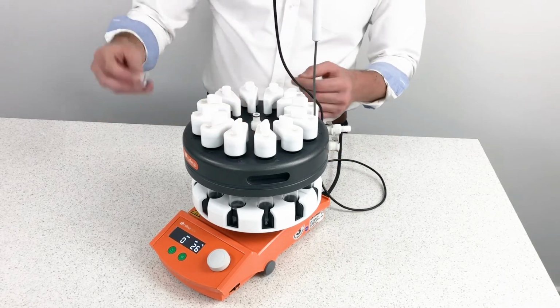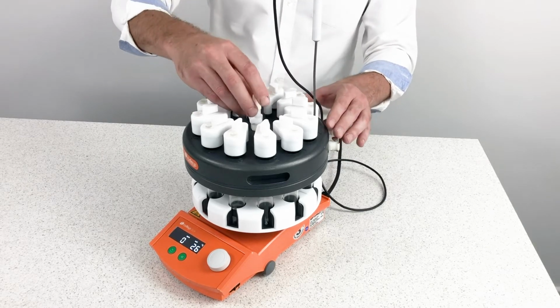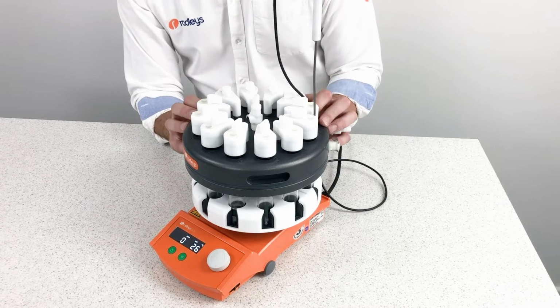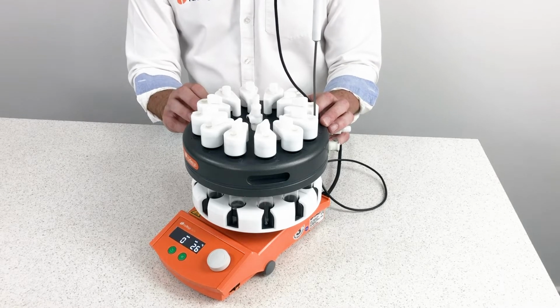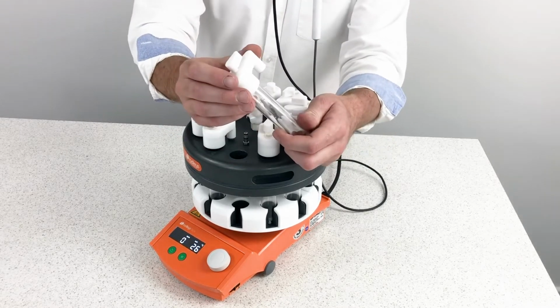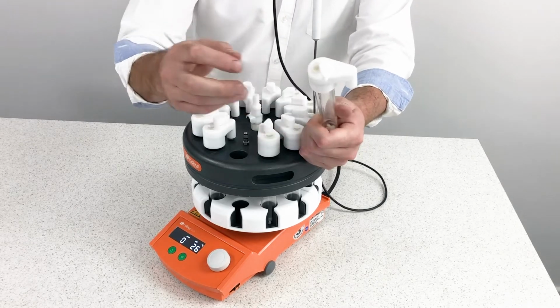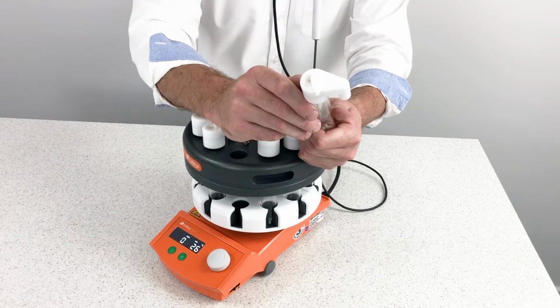So the reflux head and the inert gas supply would normally be connected to a Schlenk line at the back of the fume cupboard. You can use it to purge your reactions by doing a few cycles of vacuum or inert gas. You can also isolate any of the tubes by closing the tap on top of the cap, and you can make syringe additions or take samples via the septum on the cap.